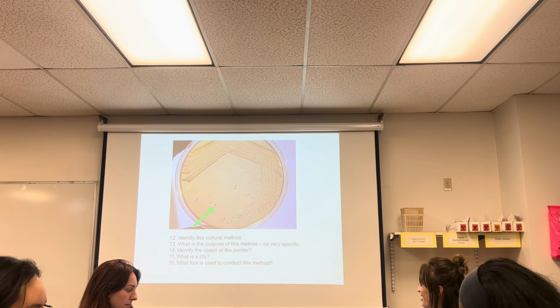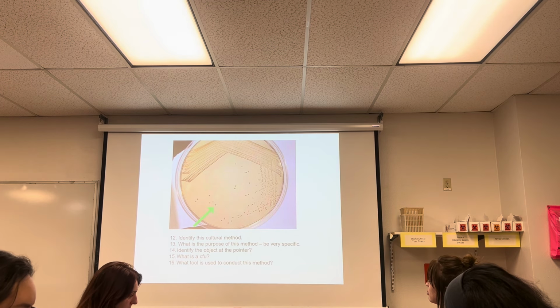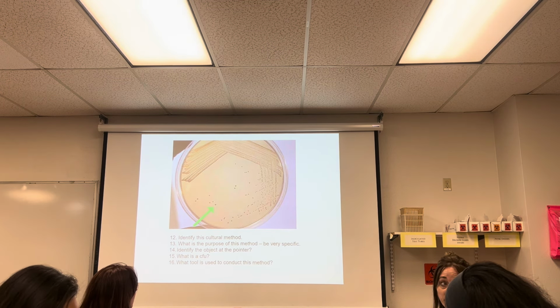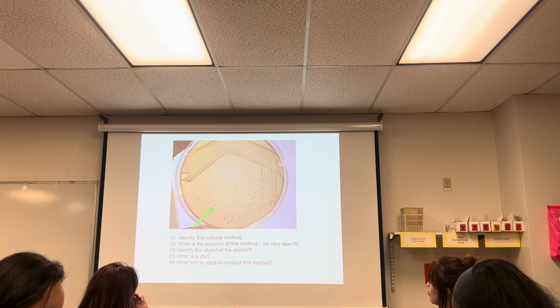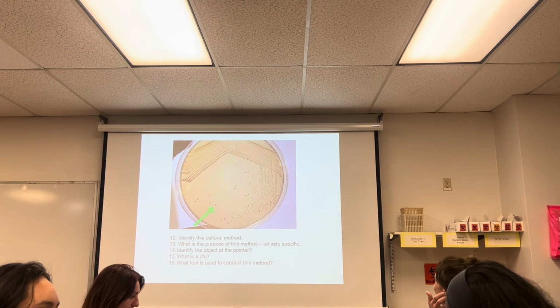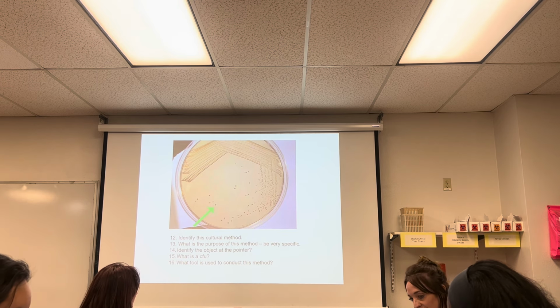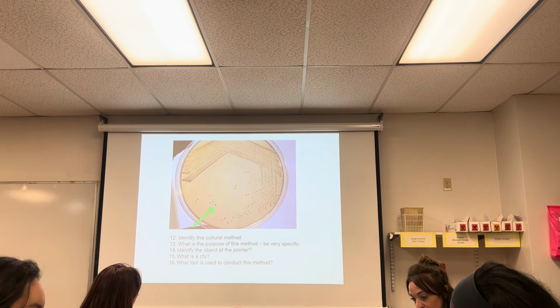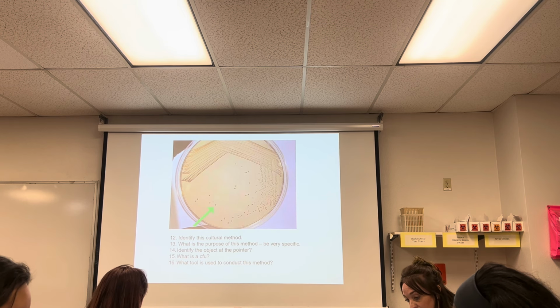Okay? Here we go. Boom. Okay, looky here. So, in your mind, what do you see immediately? Streak plate. Identify the culture method. It's a streak plate, right? What's the purpose of this method? Be specific. Isolation. All I need, you can write a sentence. The purpose of this is to isolate bacteria. I'm like, you're going to run out of room on your little page. But isolation is all I need. Usually, the answers are one word, maybe 3 words. They're not supposed to be a paragraph. Okay? All right, here we go. Identify the object at the pointer.